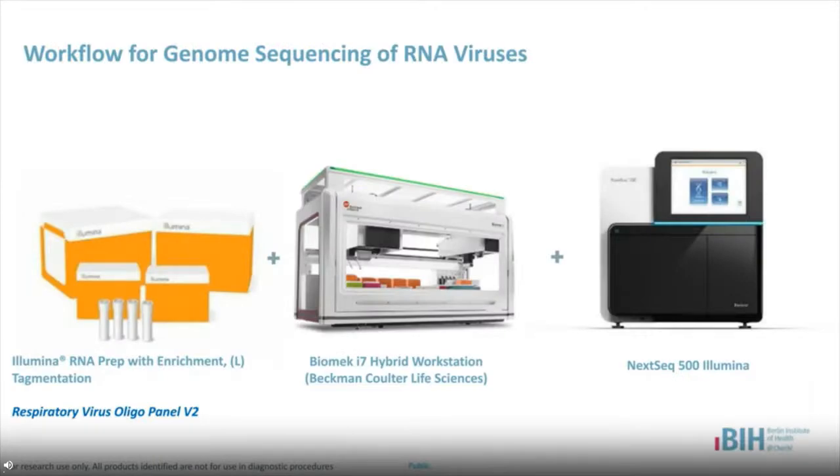In our effort to contribute a possibly high number of fully resolved genomes of SARS-CoV-2 to the GISAID database, we have implemented a comprehensive workflow that integrates automated library preparation and target enrichment utilizing the Biomek i7 Hybrid Workstation from Beckman Coulter, sequencing on the NextSeq 500 instrument from Illumina, and our custom data analysis workflow that utilizes the pipeline developed by the Robert Koch Institute in Berlin.